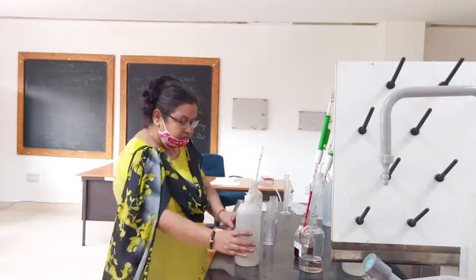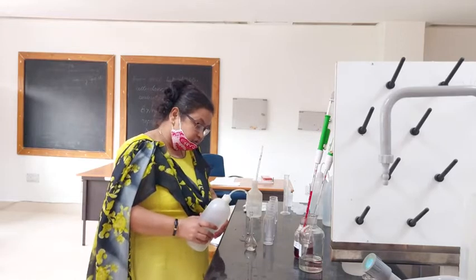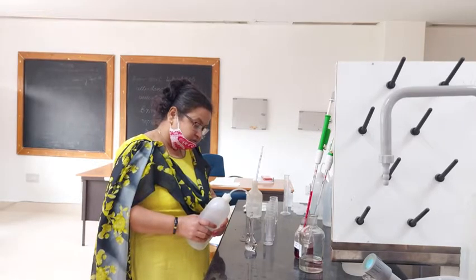And the rest is filled with distilled water to make it 50 ml volume and mixed thoroughly.